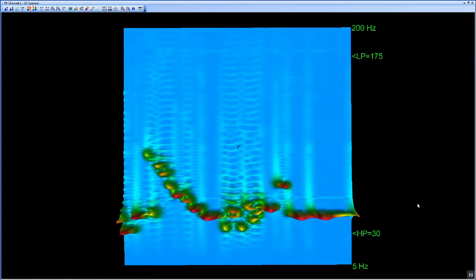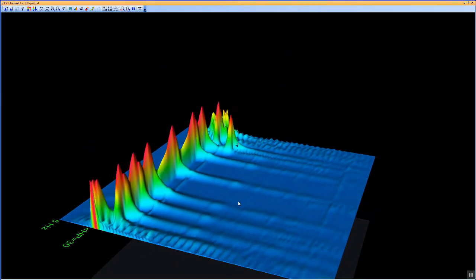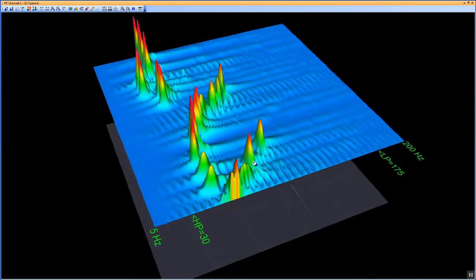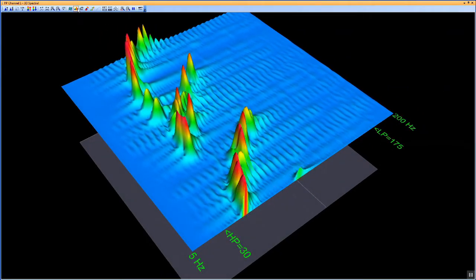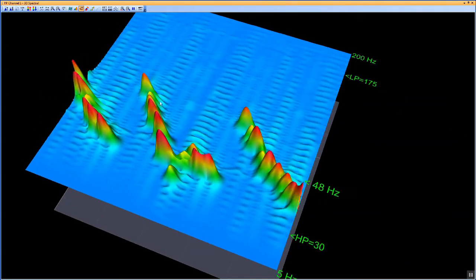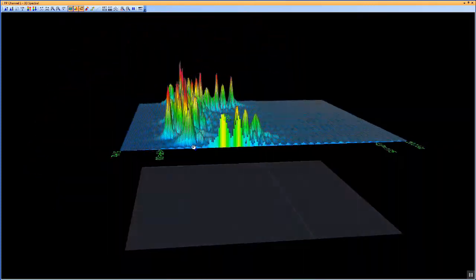Release 17 has a new 3D spectral view with mouse control of zoom and viewing angle. In addition to options common to the 2D spectral view, such as the FFT parameters, the 3D version also has markers for filter cutoff frequencies and an indicator that tracks the frequency with peak amplitude. You can toggle a surface grid and a bar graph along the leading edge of the surface plot.